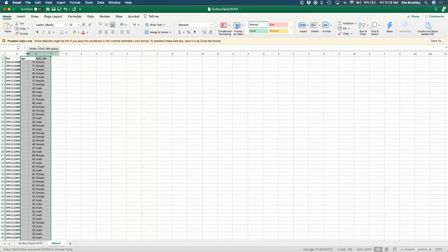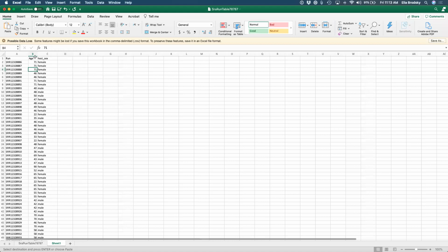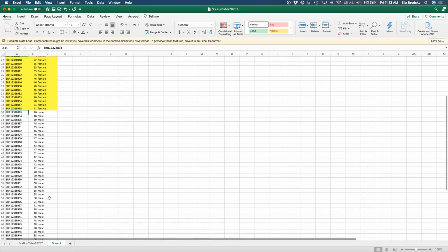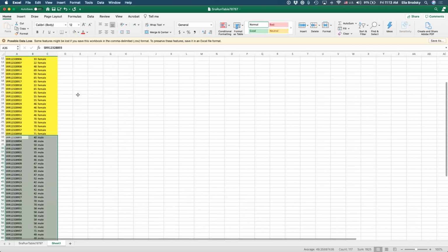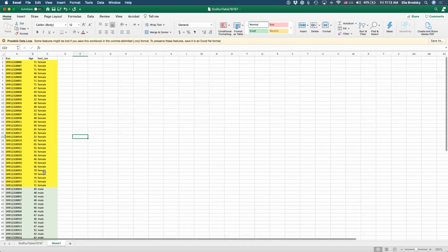So now I can group them. For example, if I want to group them by sex, which should be fairly simple, right? I just organize them, and I can compare these versus these. So I have two groups here, male and female. So if I want to do this, how do I actually load up all of these files into my pipeline?